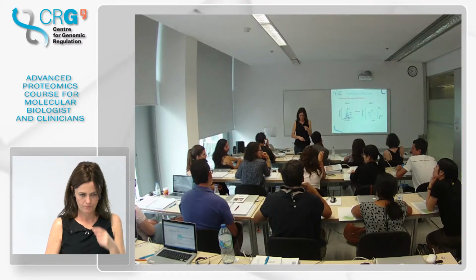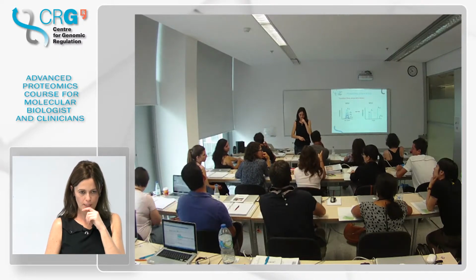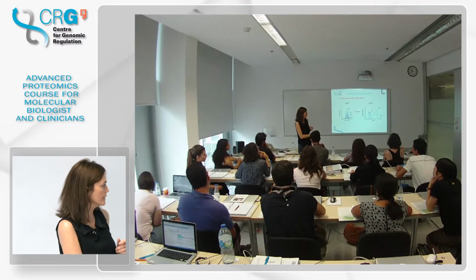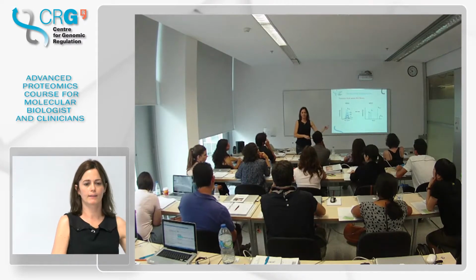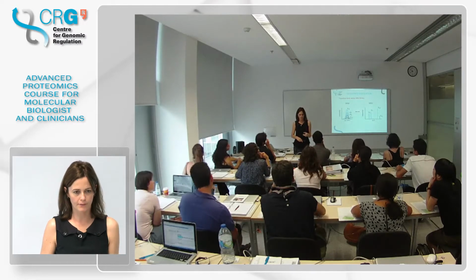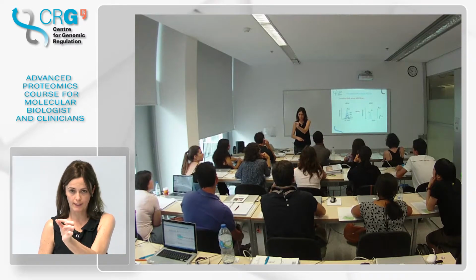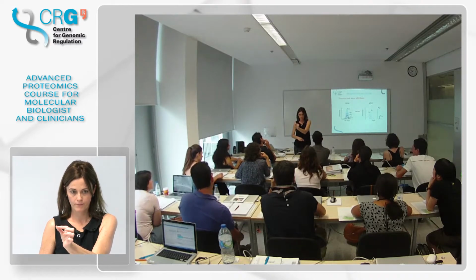You said you will select it then. Also. Yes, of course, you have to. All the Ys from the light and from the heavy will have a different mass because they include that heavy amino acid, and we want them to have a different mass. Okay, yes, you're right. No, I got it.